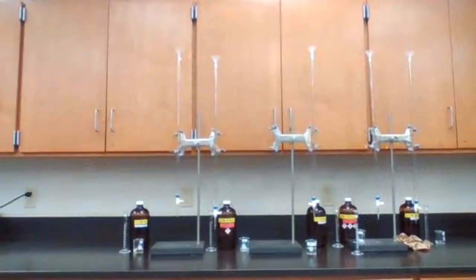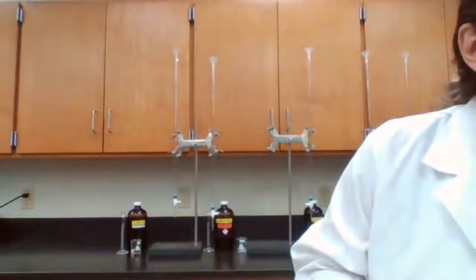I'm going to start with part D until we get the solid ammonium chloride, then go back to part C. I'm sorry for the interruption because we didn't have the solid ammonium chloride here.